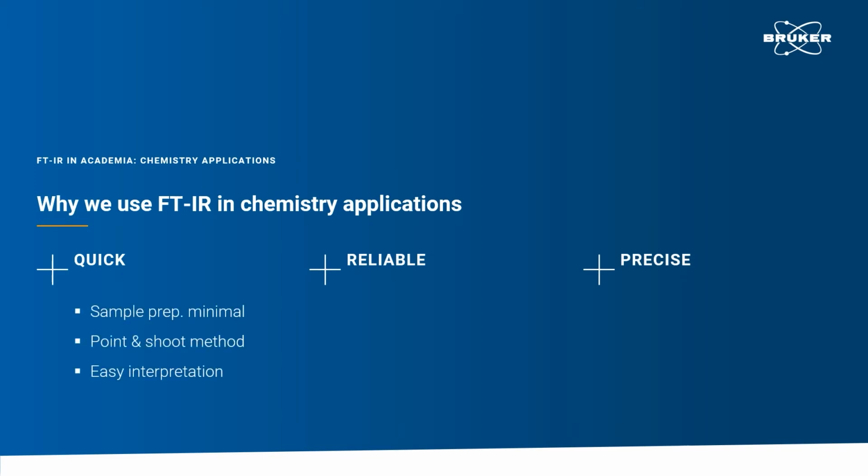The sample preparation typically is minimal, depending on the technique, and in many applications, it is a universal point-and-shoot method that allows easy interpretation of sample properties with a single measurement. Another reason is the maturity of the technology. FTIR is an established and proven methodology.